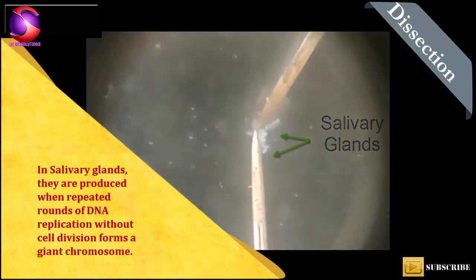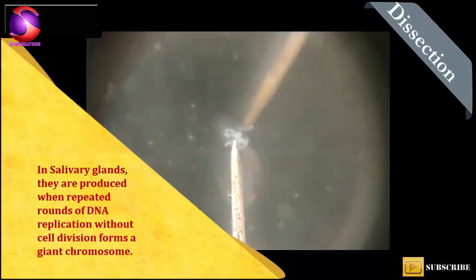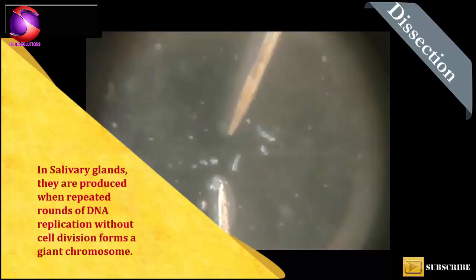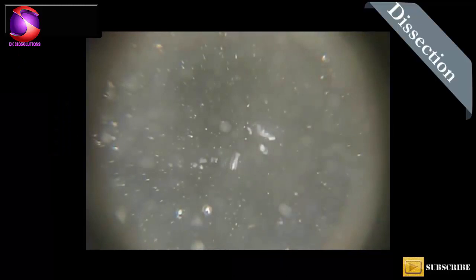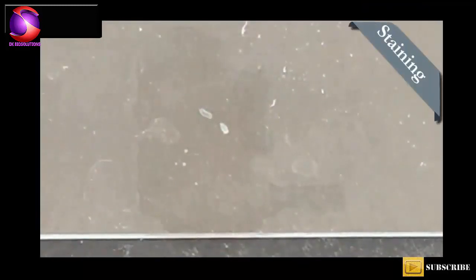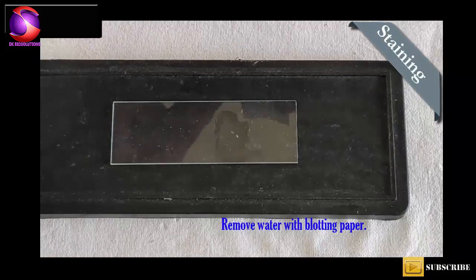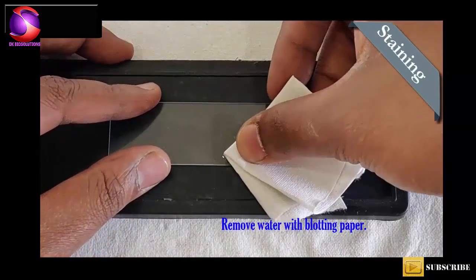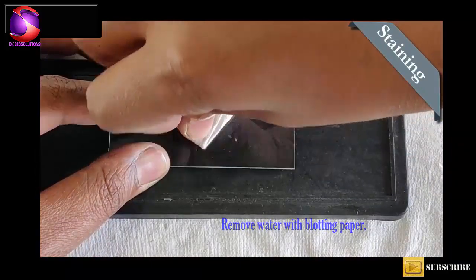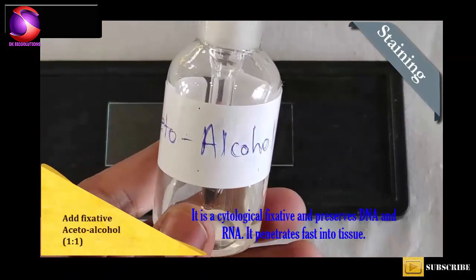Take care during this step. Before staining these salivary glands, we need to fix them with the help of Acetoalcohol. The concentration should be 1 to 1. Add 1 or 2 drops.